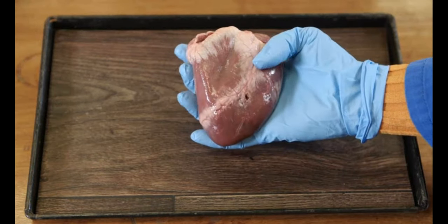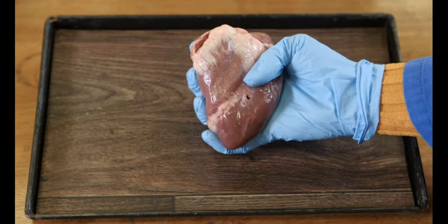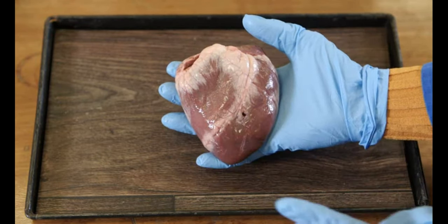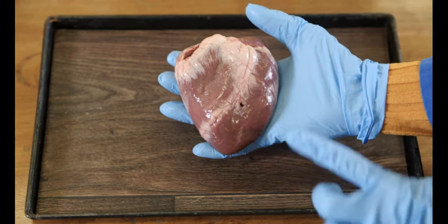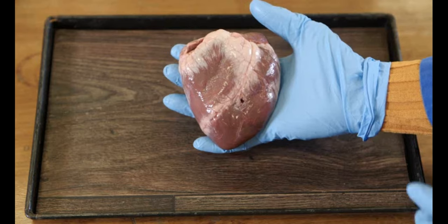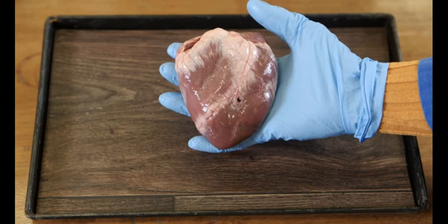The heart muscle contracts to squeeze blood out and then relaxes to allow blood to flow in. The muscle on the right side of the heart feels thinner than the muscle on the left side of the heart. This is because the left side of the heart has a thick muscular wall to pump blood around the whole body.